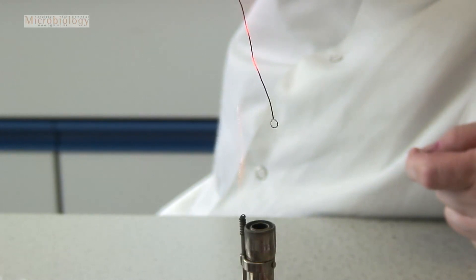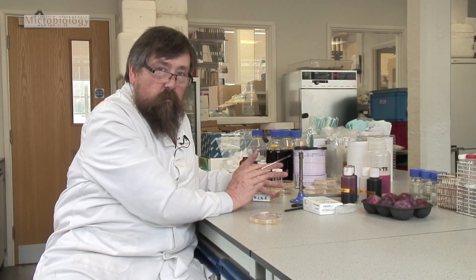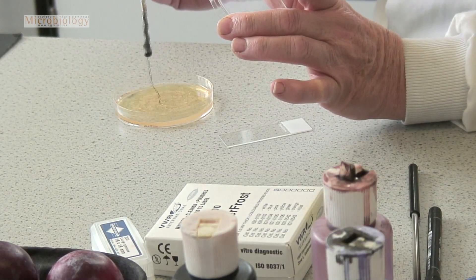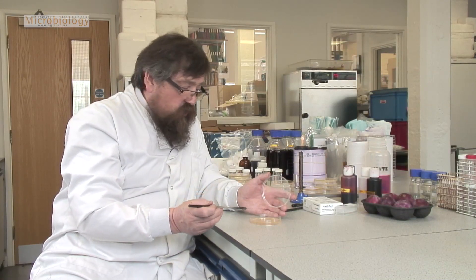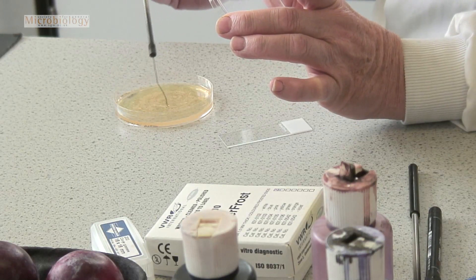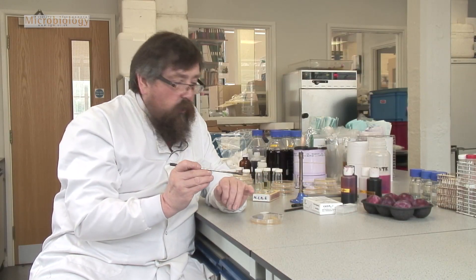That sterilizes the wire but it's now too hot to use, so I just wait a few seconds — one, two, three, four, five. I touch the jelly where nothing is growing; no, it's not too hot. And now I'm just going to stroke the surface very gently. As I stroke the surface, that little colony of cells gets caught on the loop.